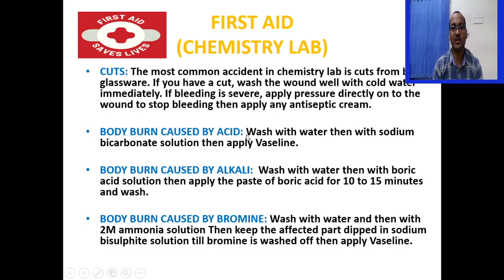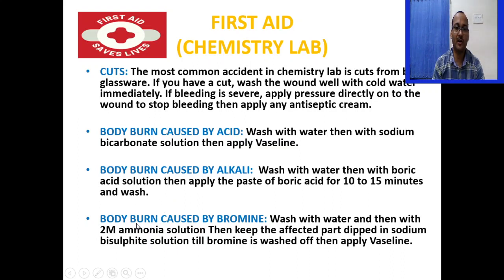If you have a body burn caused by acid spilling, wash it with water, then with sodium bicarbonate solution, then apply vaseline. If there is a body burn caused by alkaline spilling, wash with water, then with boric acid solution, then apply the paste of boric acid for 10 to 15 minutes and wash again. If there is a body burn caused by bromine spilling, wash it with water, then with 2 molar ammonia solution, then keep the affected part dipped in sodium bisulfite solution till bromine is washed out, then apply vaseline.